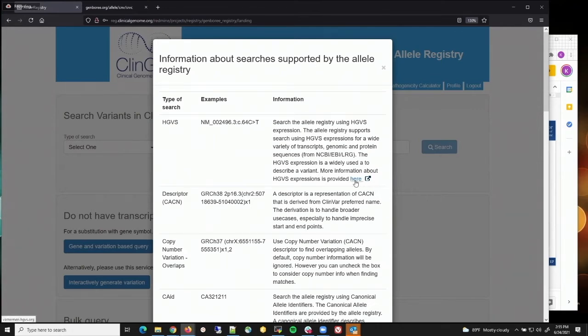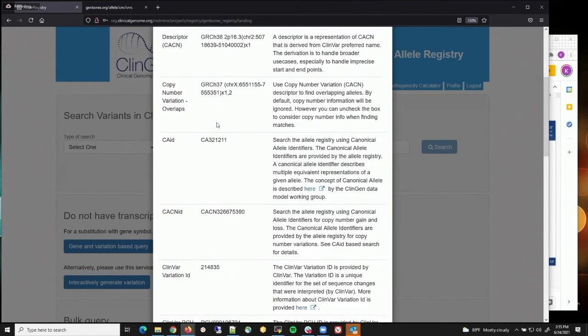We actually have some link outs to that. It basically gives you a little bit more information on what this is referring to. The main gist here is that you have a reference specified, basically saying this is a coding. You have your coordinate, and say your reference allele C, which is in your reference, you actually have observed T here. We also talk about these other entities here.